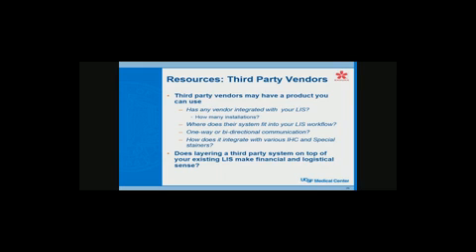And then CoPath also said they would not do bidirectional information sharing. So what that meant is that CoPath would pass information to the third party, but they would not accept information back from the third party, except for getting the status update. For instance, if a block went from labeled to gross, they would take that status update.